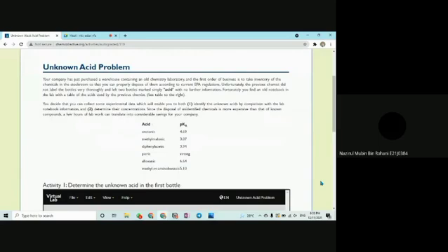The titration of a weak acid with a strong base involves the direct transfer of protons from the weak acid to the hydroxide ion. In this reaction, a burette is used to administer one solution to another. The solution administered from the burette is called the titrant. The solution that the titrant is added to is called the analyte.